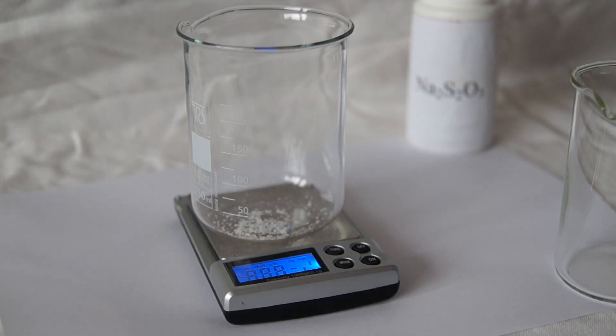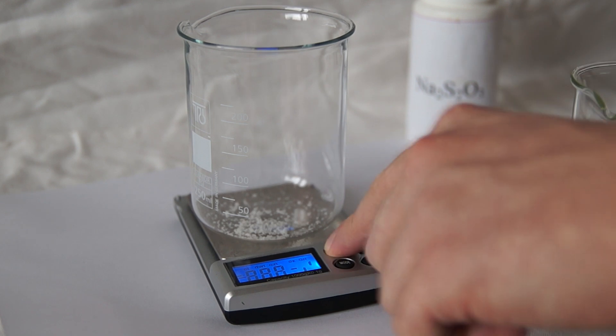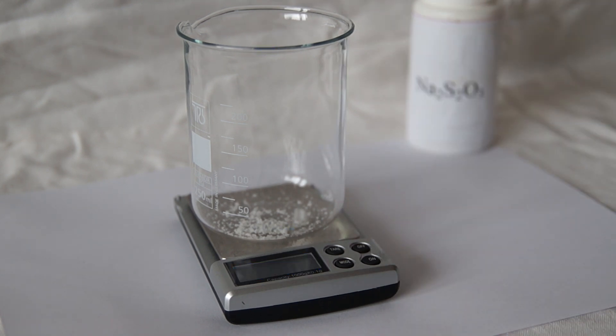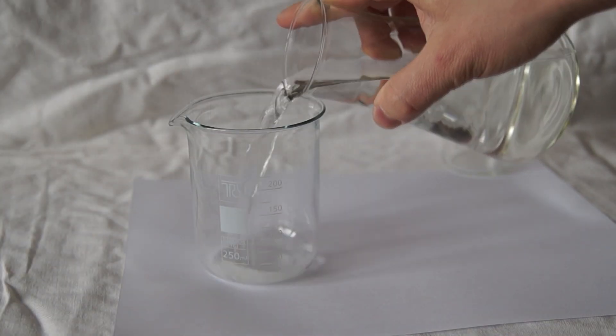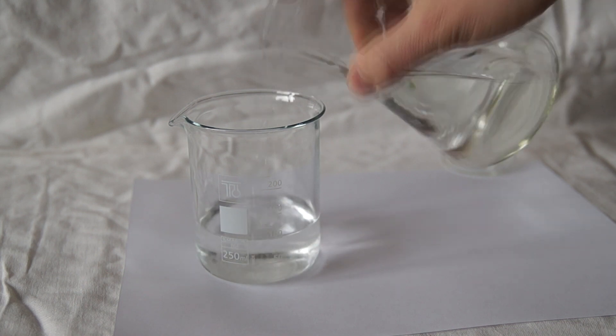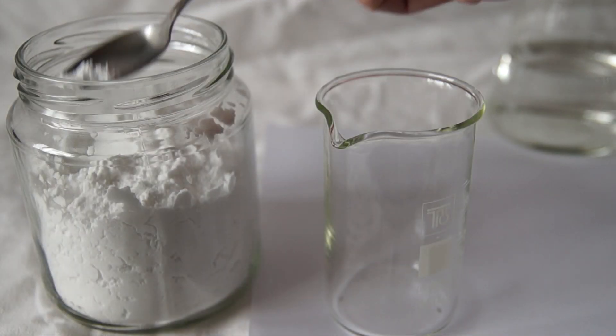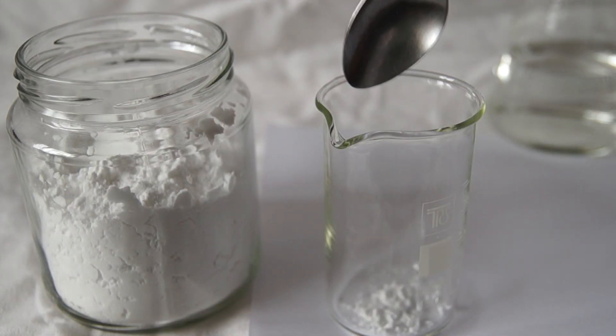First, let's take a beaker and pour there a small amount of potassium iodide. Next, dissolve the mixture into 100 milliliters of water. Take a second beaker and dissolve there a little soluble potato starch.